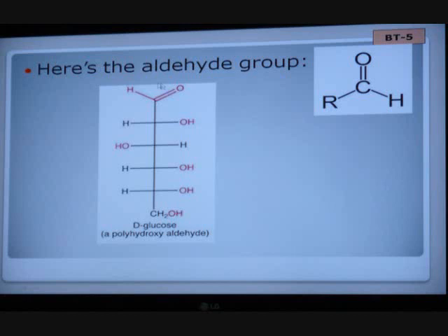Now, sucrose doesn't have that. Sucrose is two circle formations, and all the carbons are tied up, and you can't find that. Now, if you split sucrose into what it really is, glucose and fructose, then it'll turn colors, because you'll find the glucose and fructose. As long as they're together as the sucrose molecule, this test will stay blue. It won't turn colors. So I thought to myself, I might one day find me some sucrase, the enzyme sucrase, and have y'all make a sucrose solution, test it, it'll stay blue. Then take the solution out, drop in some sucrase. That's the enzyme that does what to it? That splits it into glucose and fructose.